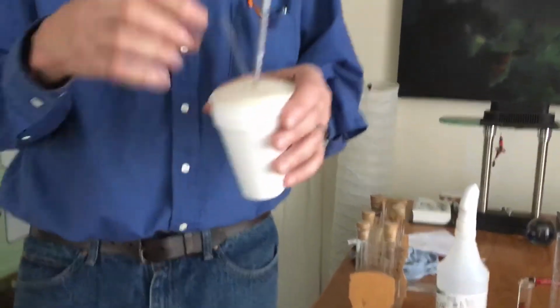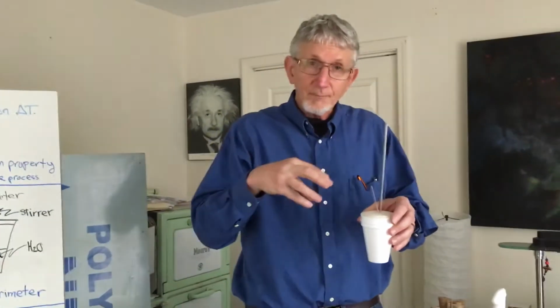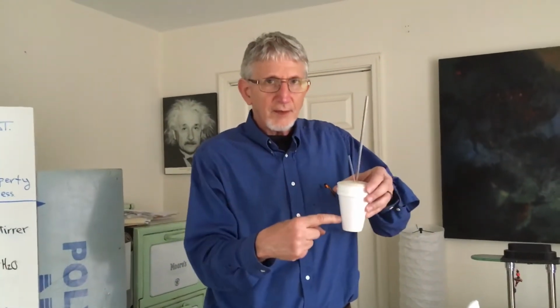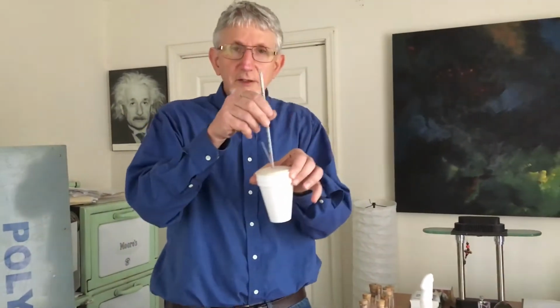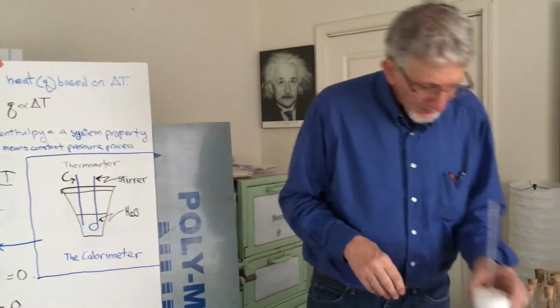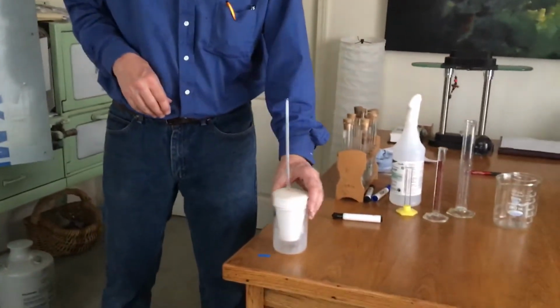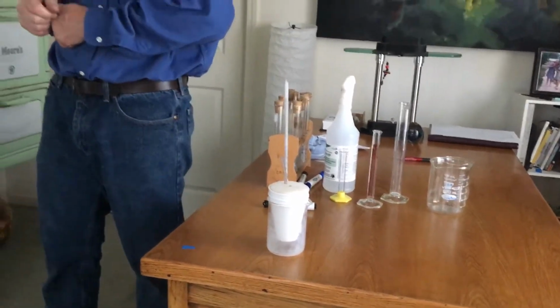And what we're going to do in this exercise for all three parts, part A, B, and C, is introduce the system and the processes, the reactions that are going to occur inside the calorimeter. They're going to occur inside of this calorimeter, and we'll measure the temperature change, and from that we'll be able to determine Q, the heat energy. Oh, by the way, we're going to put the calorimeter into a 400 ml beaker so it just stays upright and doesn't get knocked over easily.